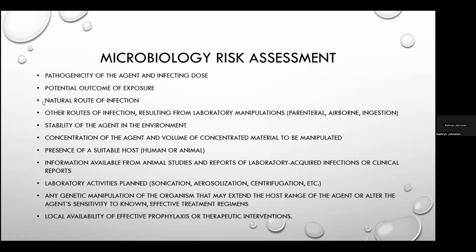If you deal with a high volume of Mycobacterium tuberculosis, obviously you've got to be concerned with airborne transmission for all of your respiratory specimens, and also specimens that are coming from the theater that may have a potential for tuberculosis, such as tuberculosis osteomyelitis and such.